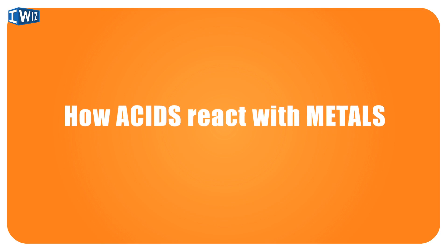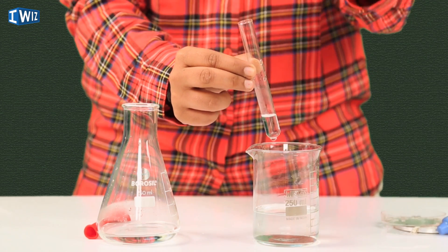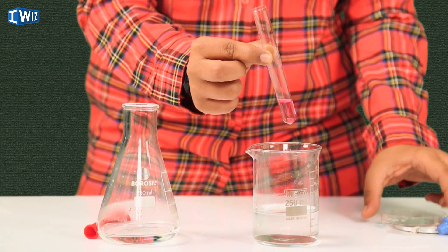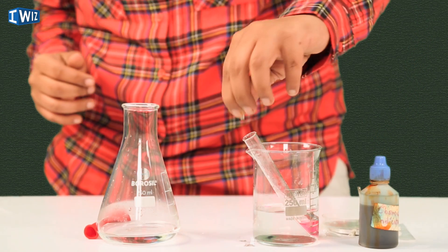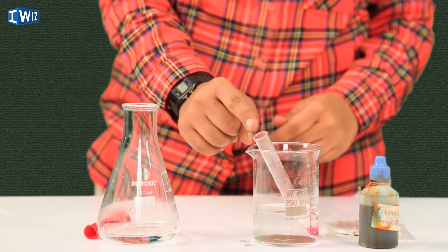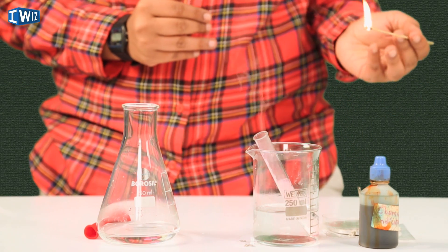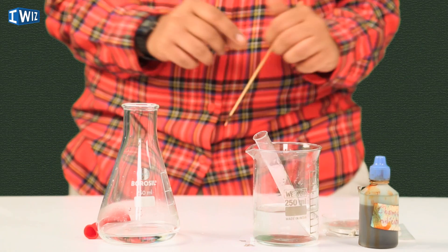The first one is how acids react with metals. You can see I have a magnesium ribbon over here — I've cut it into small pellets — and I have some acid here. Let's check whether that's an acid. Never take my word for anything, so let's put in the universal indicator. We can see there's a color change and that's an acid. I'm going to keep this inside. The reaction gets quite hot; over here I have a water bath. I put this magnesium inside the HCl and immediately you can see some gas coming up. This wants to go directly up, indicating that the gas is a lot lighter than the atmosphere. And if I put a flame next to it, you'll hear the pop sound that is characteristic of the hydrogen gas that comes out.